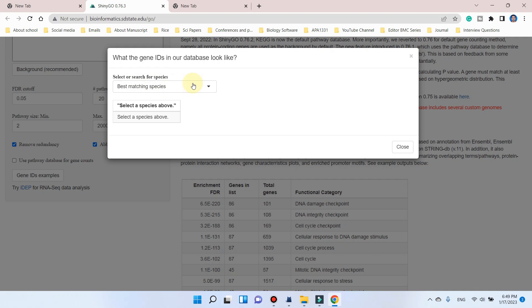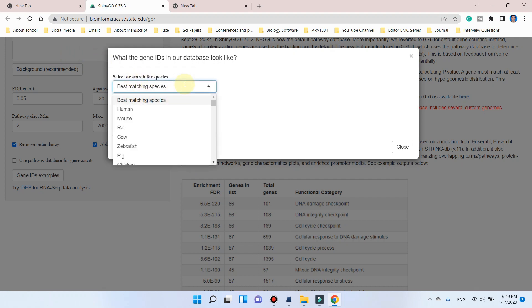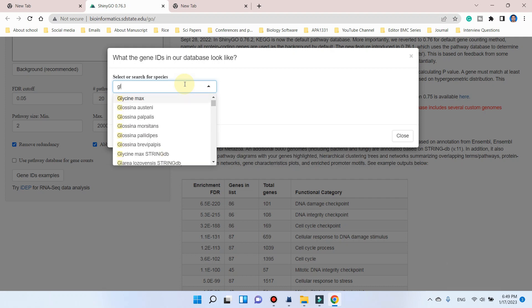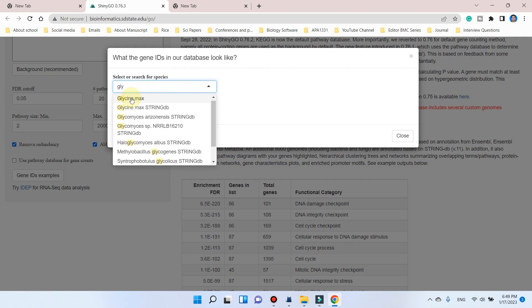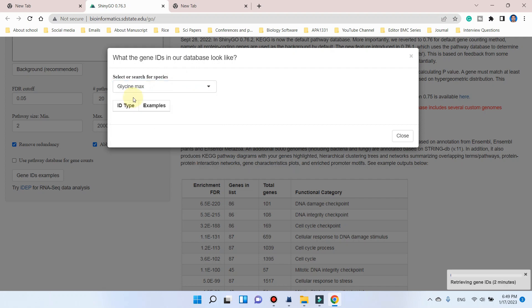Because I am performing my gene enrichment analysis on Glycine max, I will search Glycine max. You can see here, here we found the Glycine max.